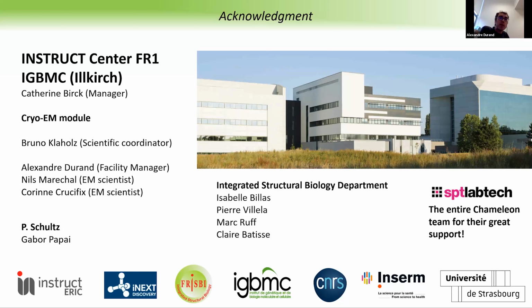At the moment, it's not like we have a choice because the only available grids are copper grids with carbon film. I know that gold grids will be available soon, or at least they should be, according to SPT Labtech. We already had one user with the chance to test them, and it looks promising. So for now, the only ones that we have are the carbon and copper, and we hope that the gold grids will also be available soon for more regular usage. Because it's true that for cryo-EM, generally speaking, the gold grids are working very nicely and working better.